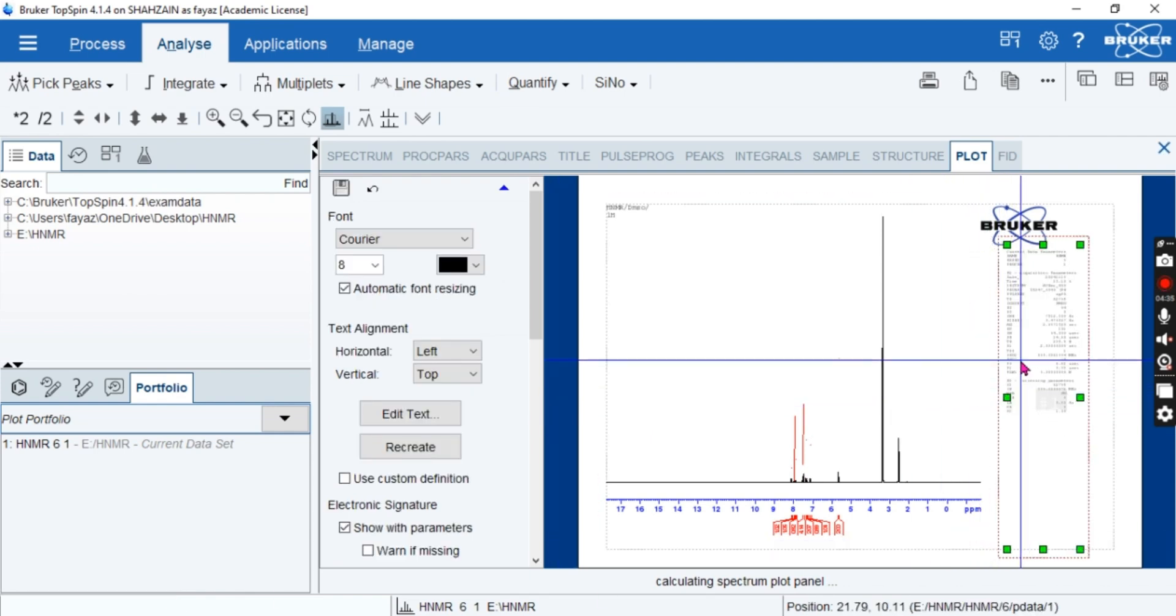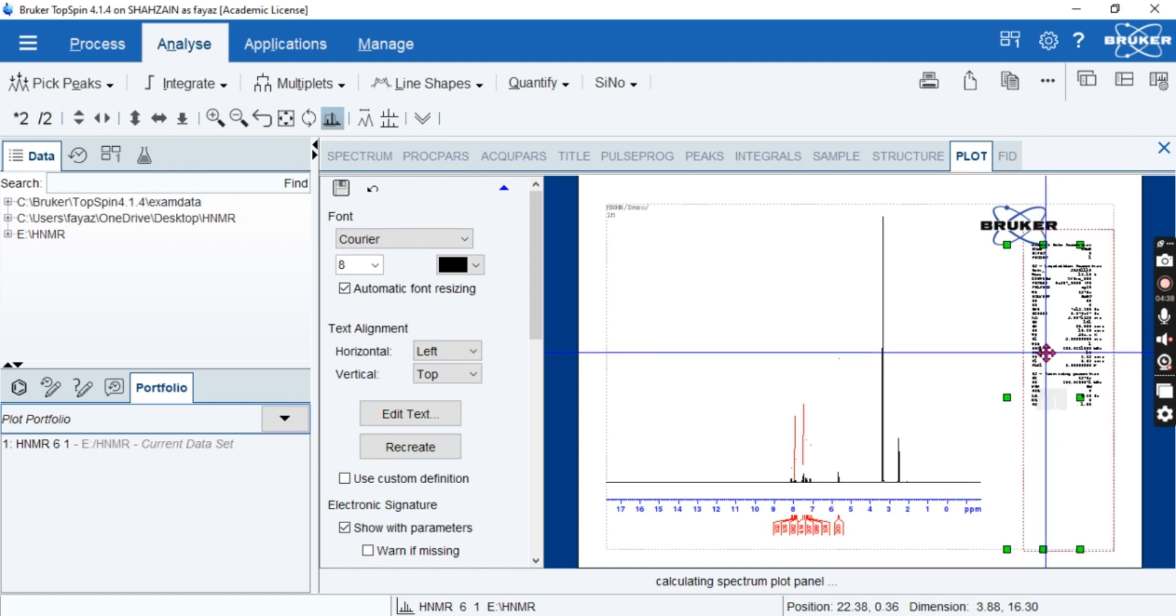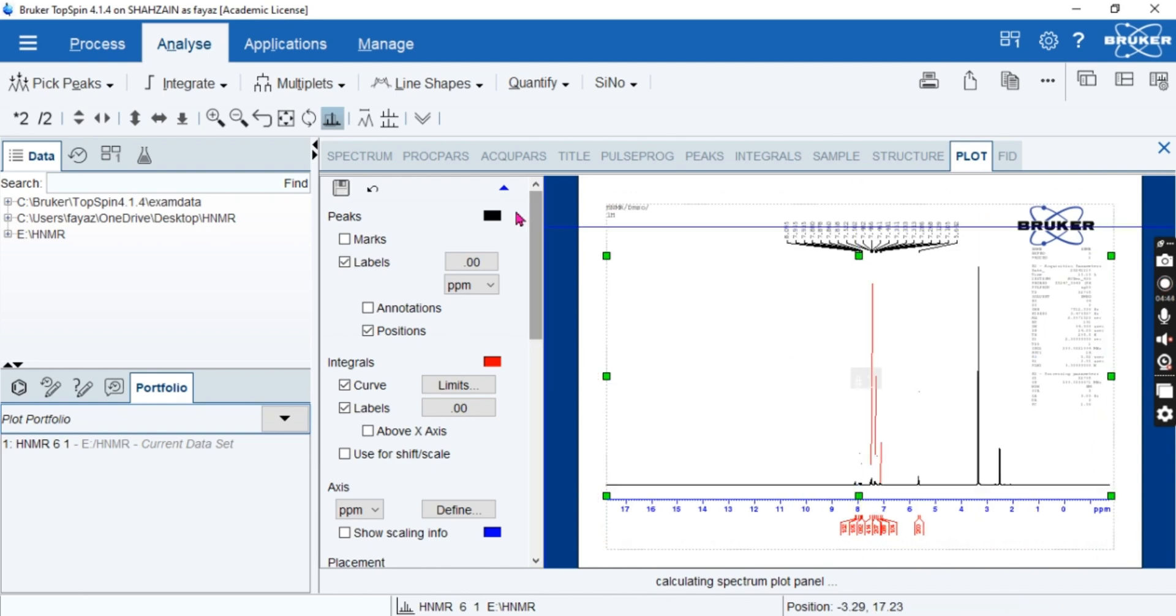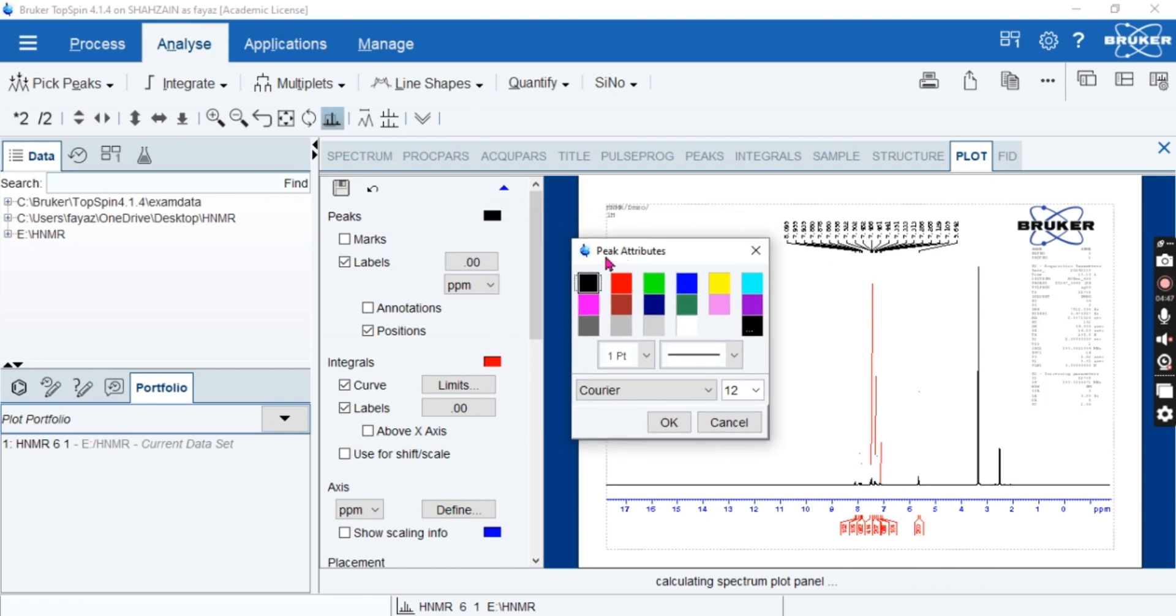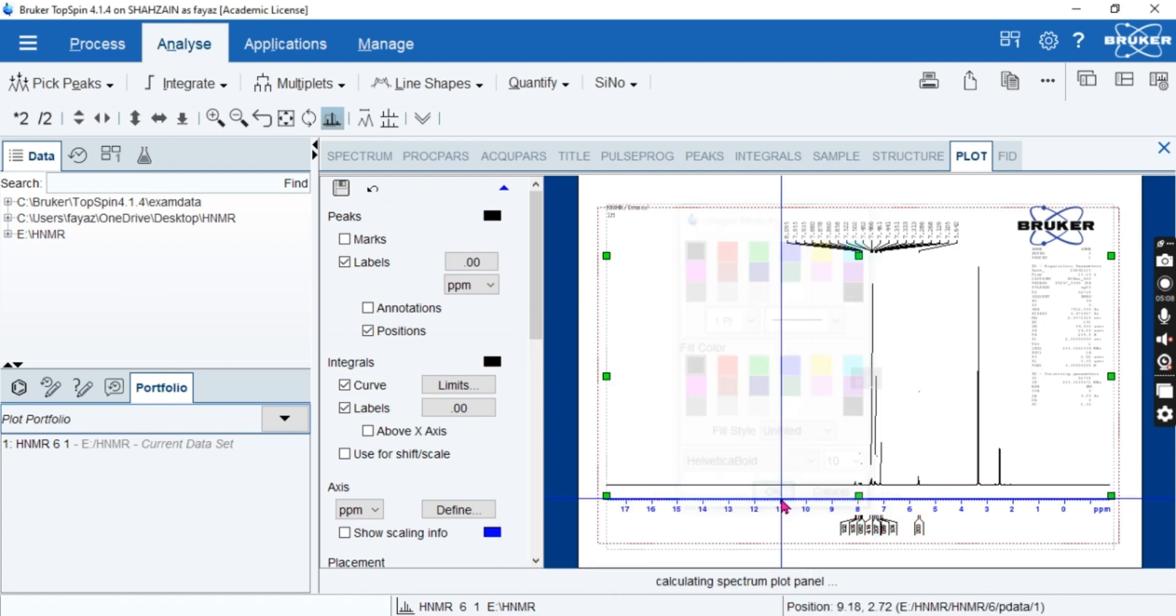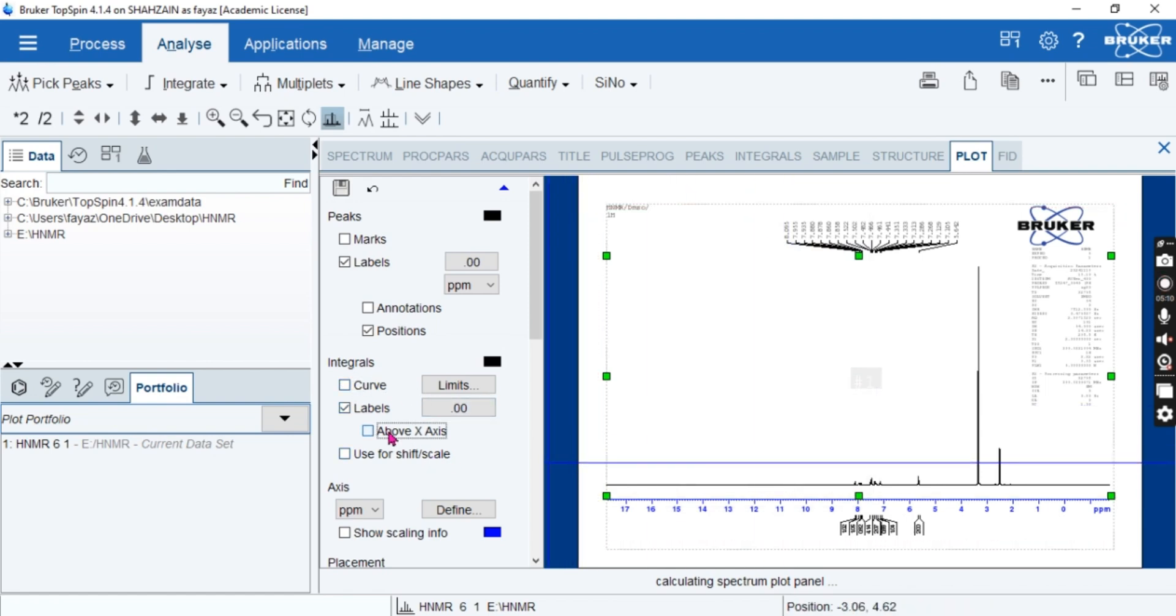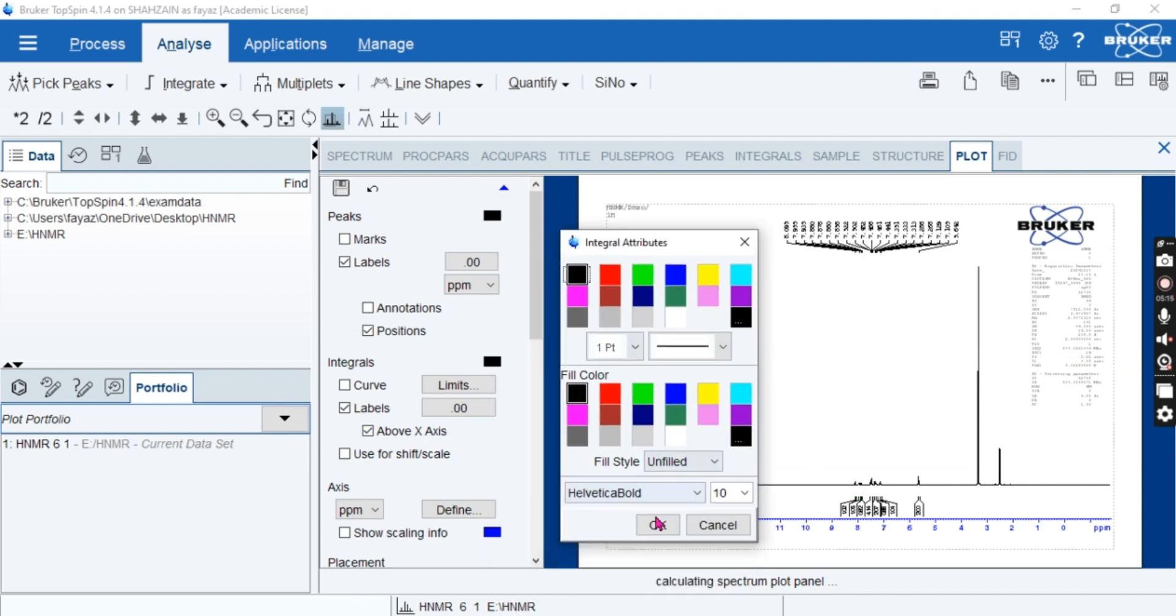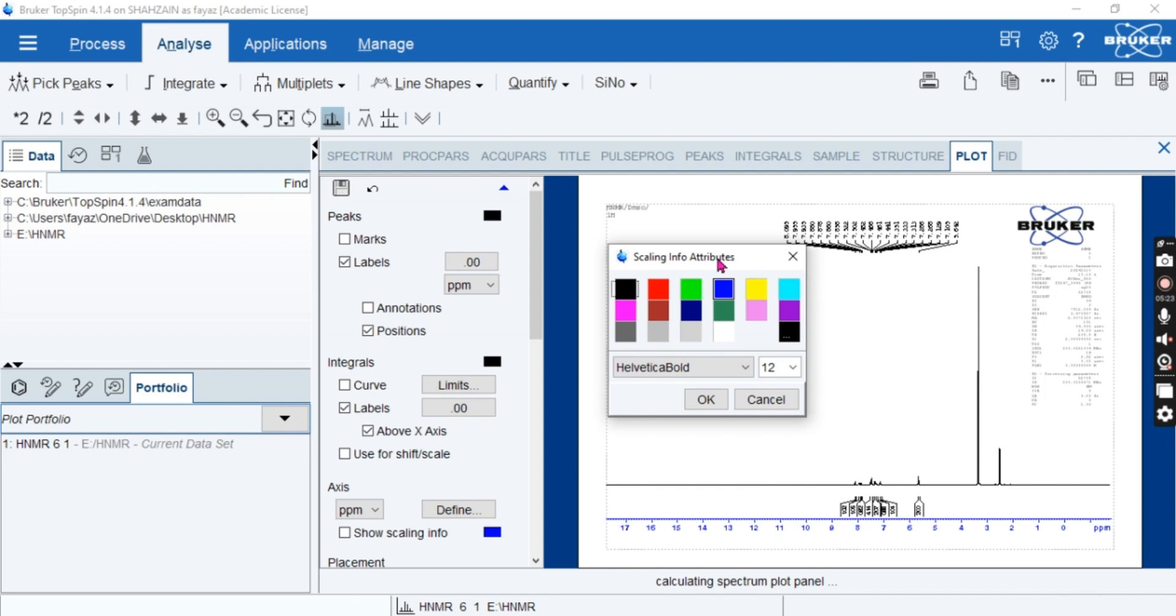Okay, so let's move it here, and let's here. Okay, we have, so we have mark of labels here, labels will be shown, and we have options of peak attribute and this should be one, and should be black. We have another color, this should be also black that will be suitable. You can change color, it depends upon you. And this should be above of this region and this was below of this region, and you can, this is the above of region. And let's change color, color is the same black, and we have a scaling info attribute. This is the scaling info attribute and it should be black color.